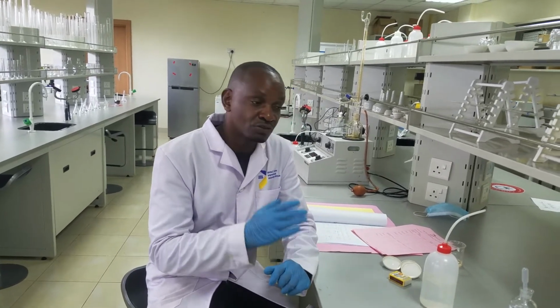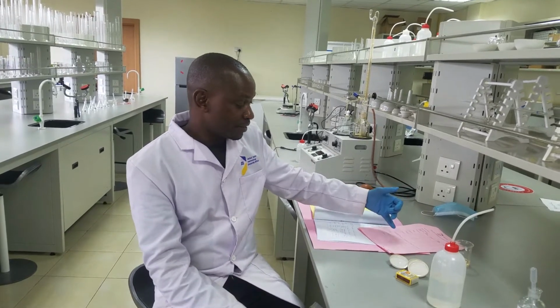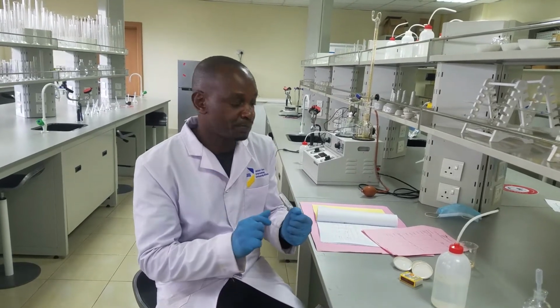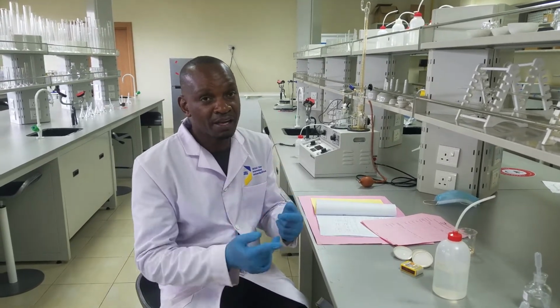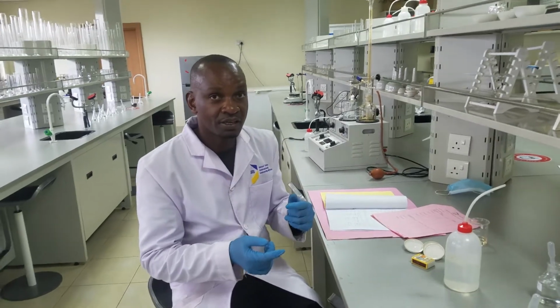We are only going to do a chemical test to separate the 2 hydrocarbons through combustion. Under combustion, we'll just put a few drops and then we light to see whether they can burn, and if they burn, observe the nature of soot that comes out.